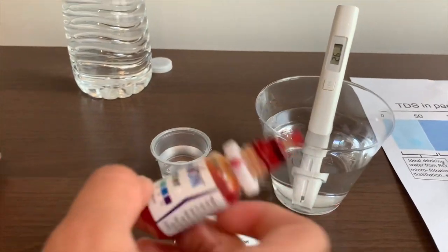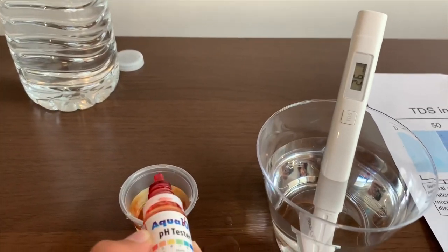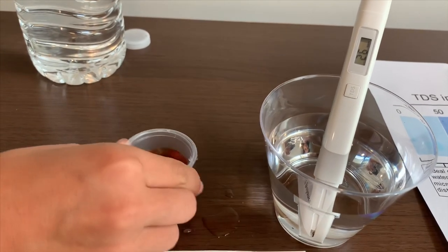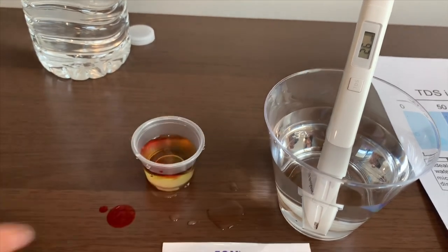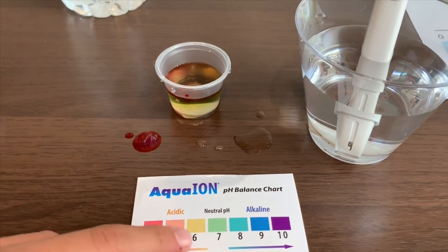Now let's test the pH level. Two drops. I give it a 5.5.